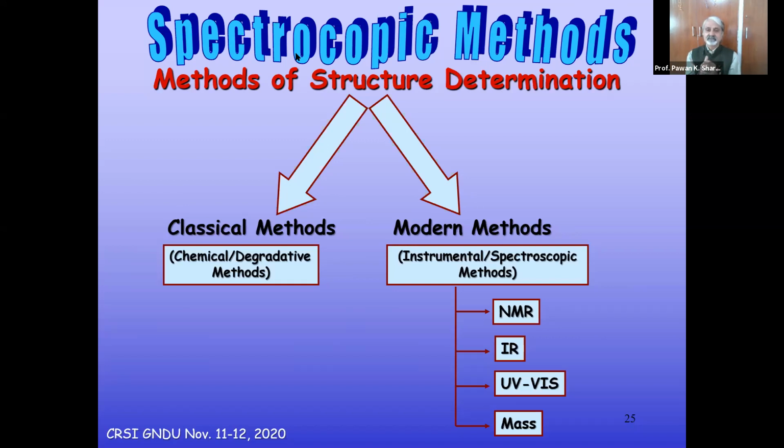I can give you an example. Say, for example, the presence or absence of a functional group, let us say of nitrile, that you can do so easily on the basis of a 10 lakh rupees IR machine, which you may not be able to do that easily on a 4 crore NMR machine. Right? So they do not compete with each other.